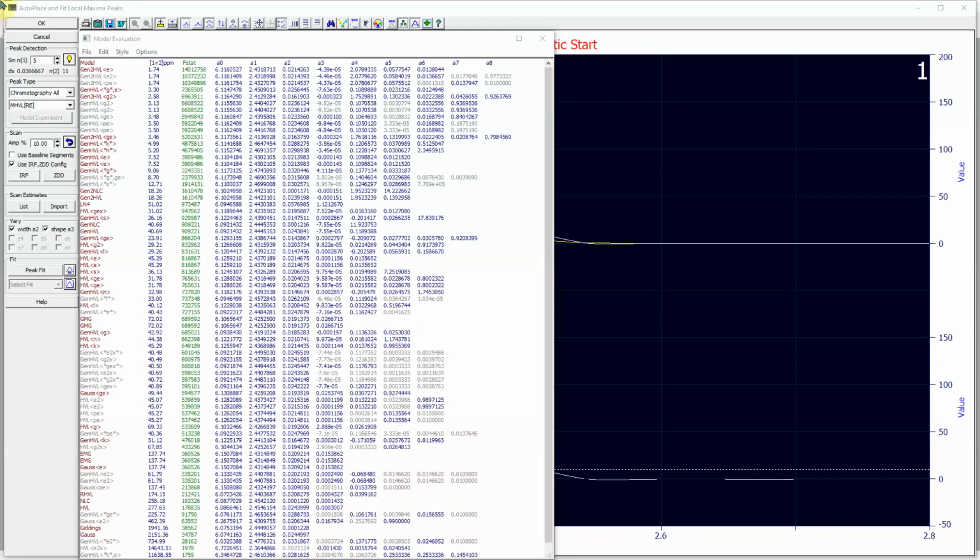In a science as complex as chromatography, there may be many reasons why certain models perform better, and we have selected an example here that illustrates this point. At this stage, the fits are complete, and we have a summary of the models with goodness of fit and parameter values. In this case, we sort by F statistic, and we also report the statistical error in parts per million. A 1 part per million error is an R squared with 6 nines after the decimal point.